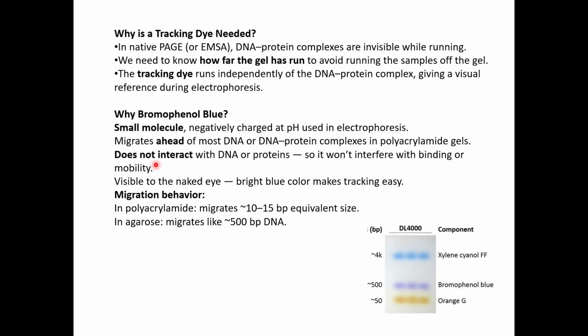So we have all plus plus plus here. It's a small molecule. It's negatively charged. It migrates faster than your DNA protein. So you don't lose your sample. So it will run faster. So as soon as your bromophenol blue reaches the end of your gel, or if it's released also, you will be sure that your DNA or your DNA protein is still present in your gel.